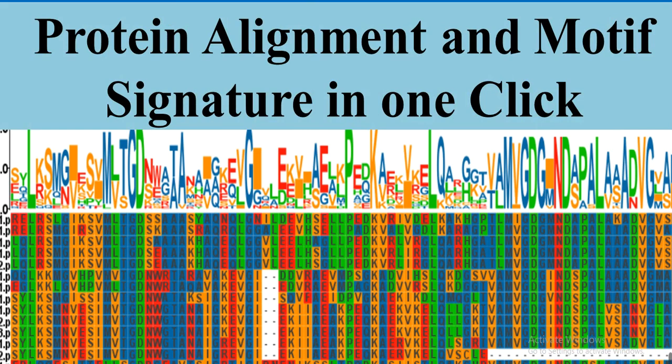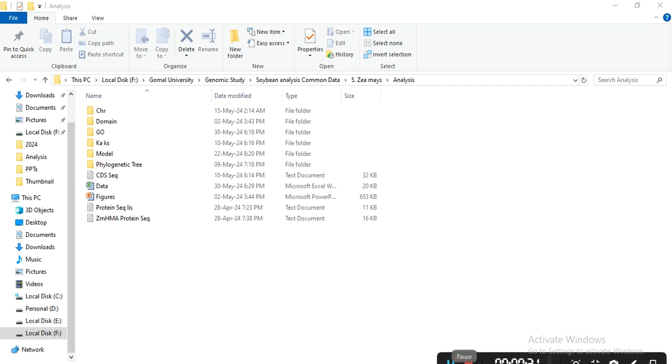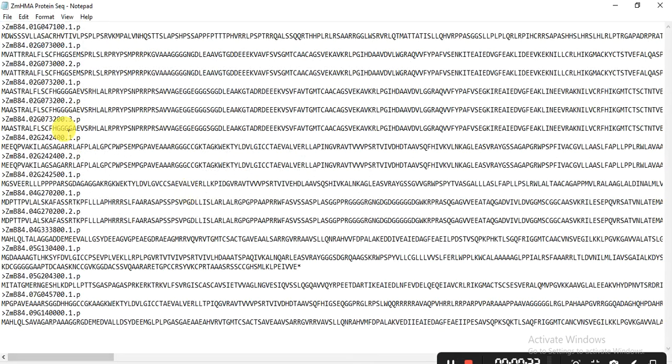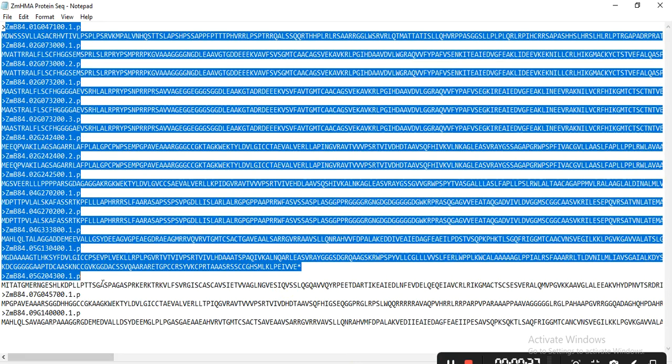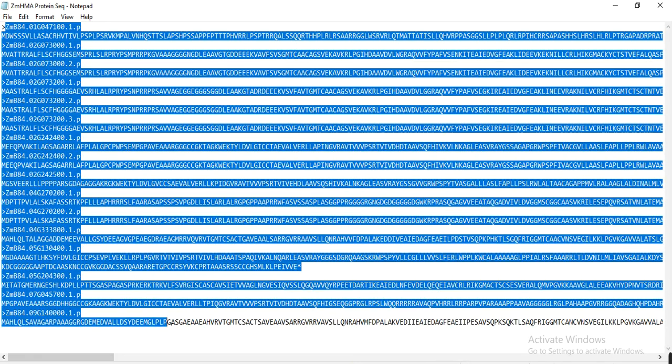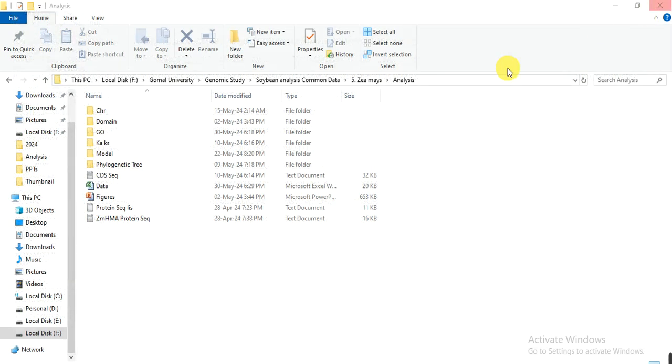We'll create a beautiful alignment which contains beautiful colors and also the motif signature in one click and in one analysis. Let's start. So this is my file that contains my protein sequences of a gene, and I want to make the alignment of these protein sequences.